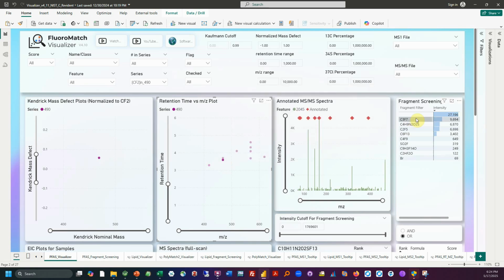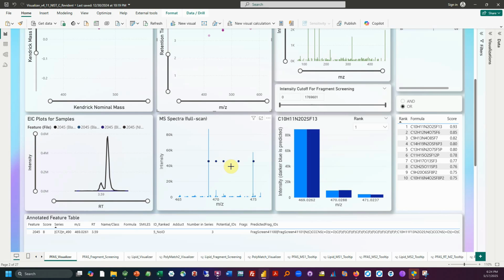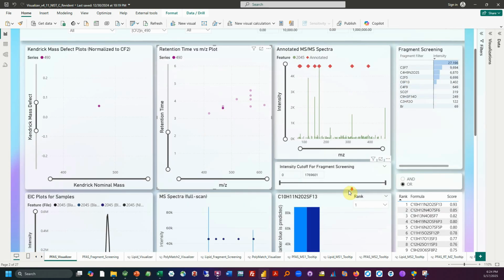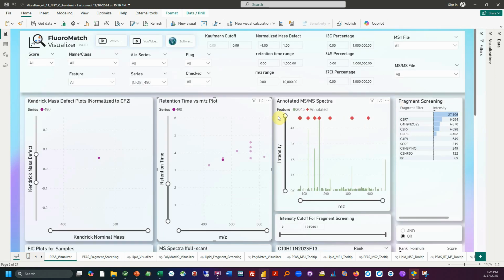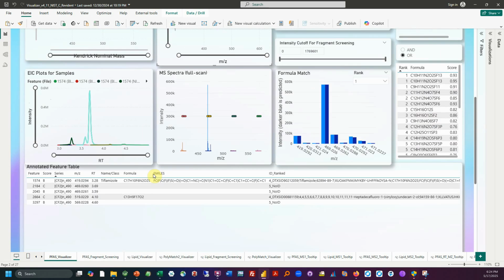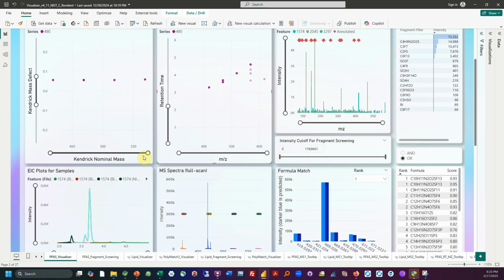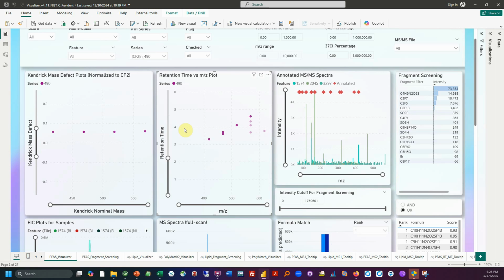Here it is. This is an amazing spectra. And we look at the MS1 again, it's clean. The MSMS spectra is extremely high, lots of PFAS-related fragments. The formula prediction does give you a highly fluorinated species. And so, to me, the spectra is definitely a PFAS species. And we have this nice trend line over here, where I would say, yes, indeed, these species are correct and are a PFAS. And then the question, of course, is, what type of PFAS are there? And that we may not know. But at least we've discovered very quickly a new PFAS series.